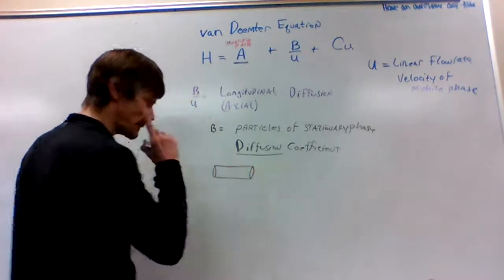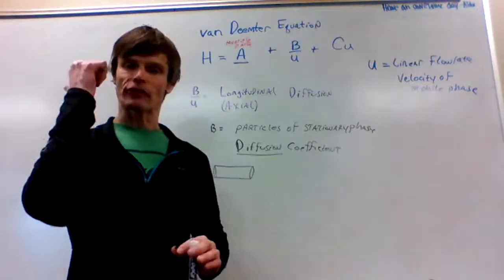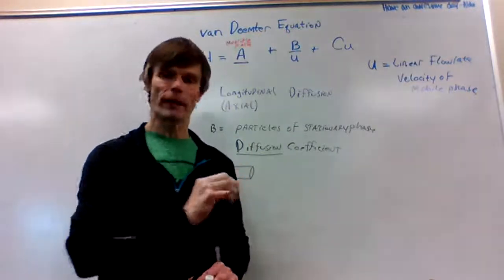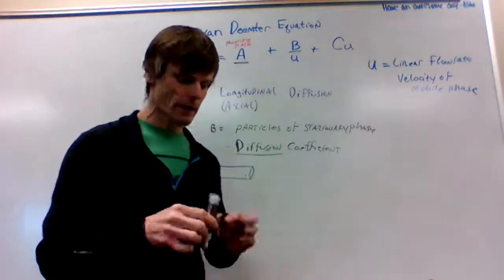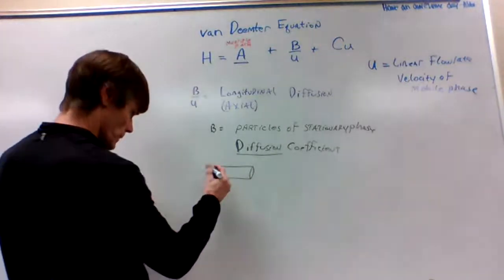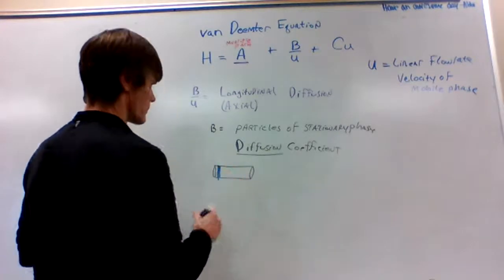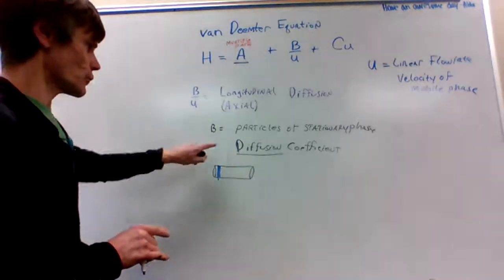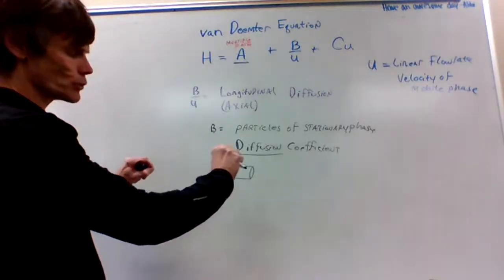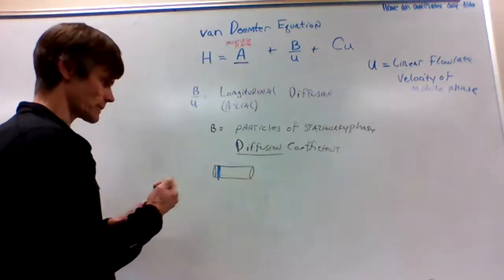And what we say happens when we put a sample on there, we put it in there like a plug. I mean, our idea is to go in and just put a sample in quickly. Don't slowly put it in. Just plug that thing in there and bam, it's on its way down the column. So there's our band that we originally put in there. But what happens? Diffusion, longitudinal. Longitudinal means it's diffusion along the length of the column as we travel from the entrance to the exit.